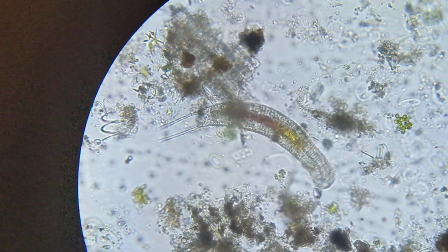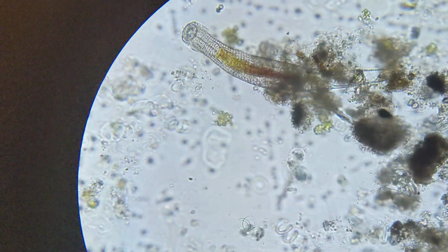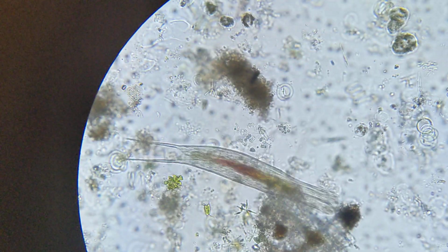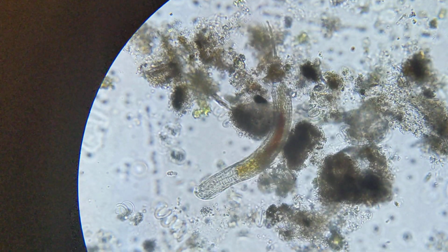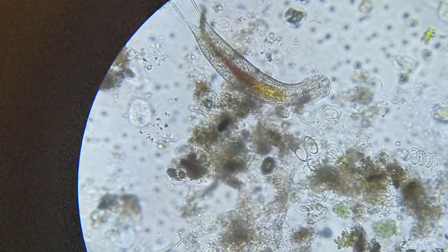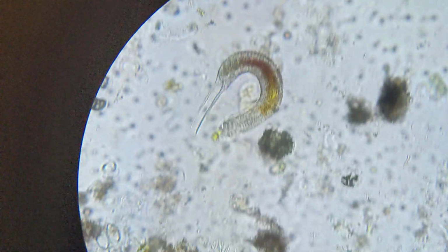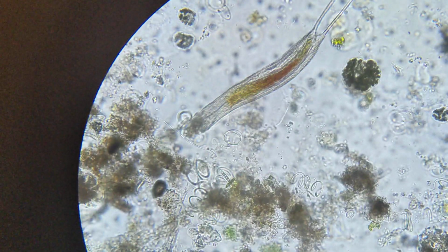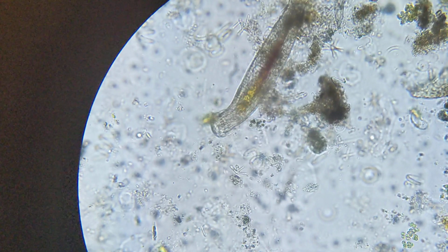And that does suggest a little bit that perhaps this is a gastrotrich, because I think they live in the oxygen poor mud at the bottom of ponds rather than the oxygen rich water at the top of the pond. So I'm not sure if this is because things come into and out of the pond all the time, or if it's lived in the pond the whole time, and I just sampled from the wrong spots within it.